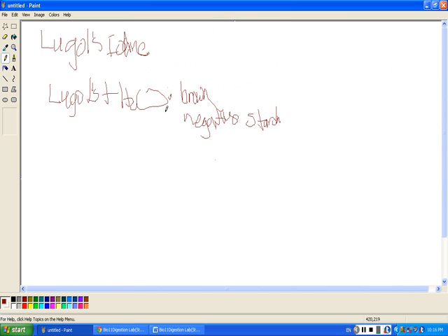So then once again, this is a control experiment because all we're doing is adding water in this particular case, which means that we're just adding water with the indicator itself. There were no other variables that we're adding to this. So this will be our negative control.